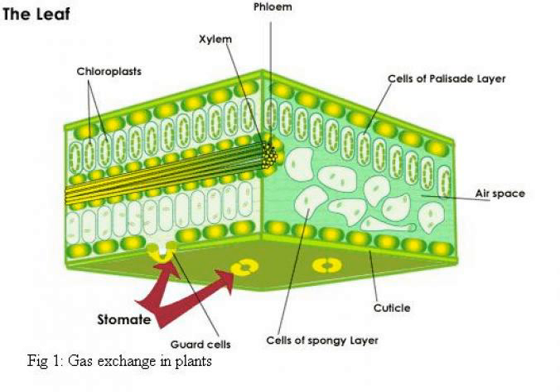The objective of this lab is to determine the stomata density of two different plants. Materials: clear nail polish, clear cellophane tape, microscope slide, and a microscope. Procedure: 1. Leaves from two different plants have been collected. One is labeled specimen 1 and the other is labeled specimen 2. Take a single leaf from each specimen.